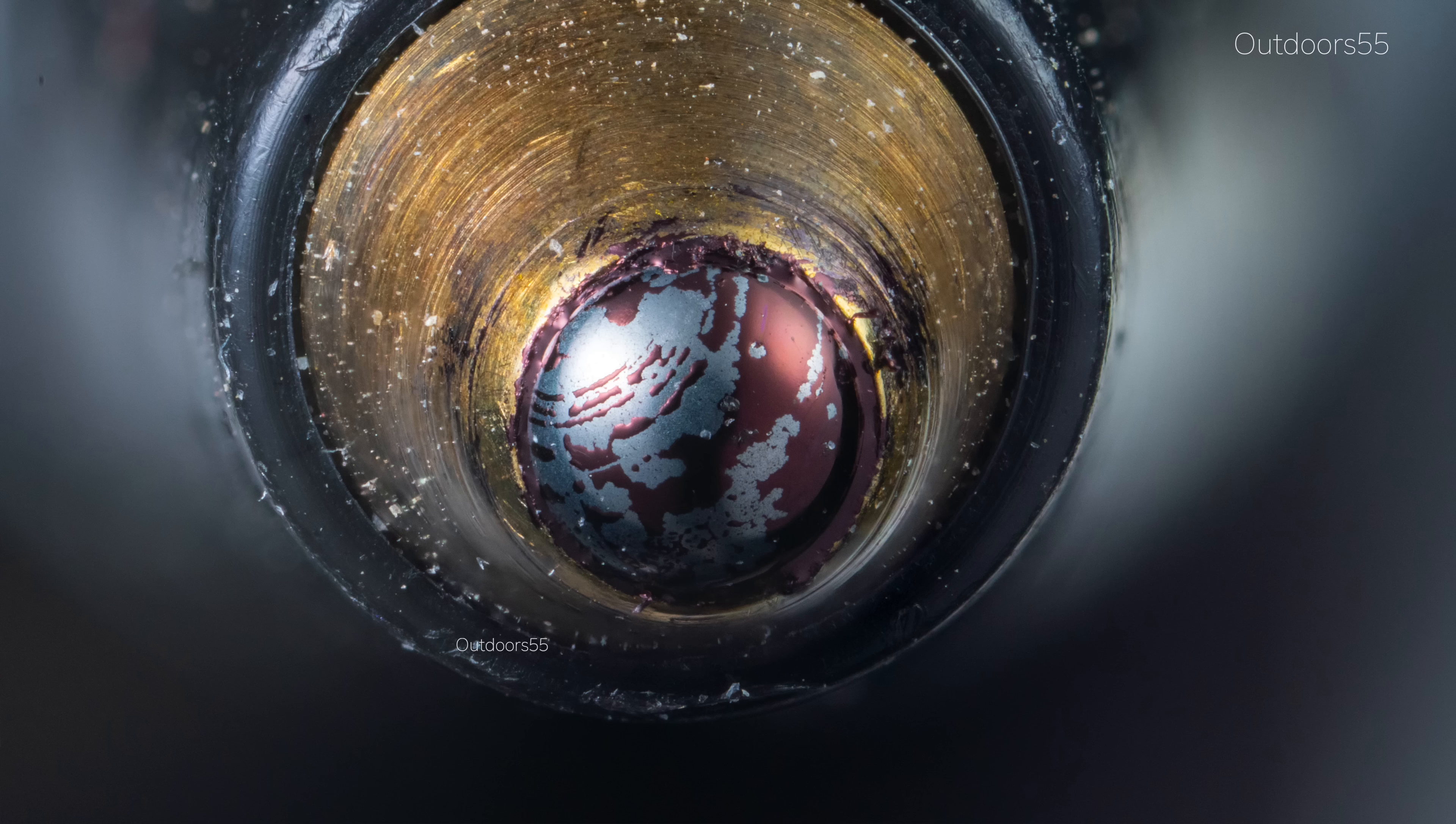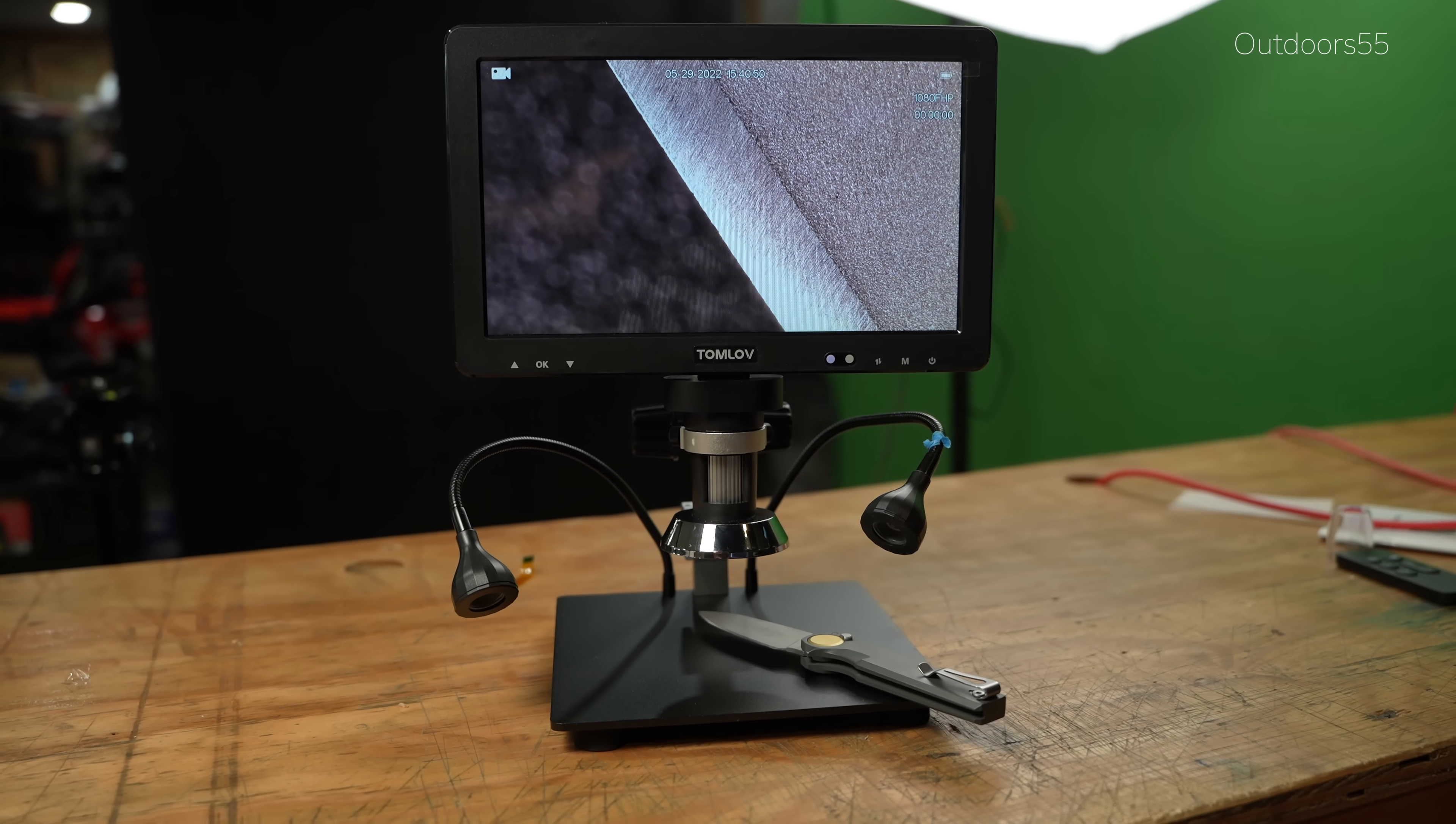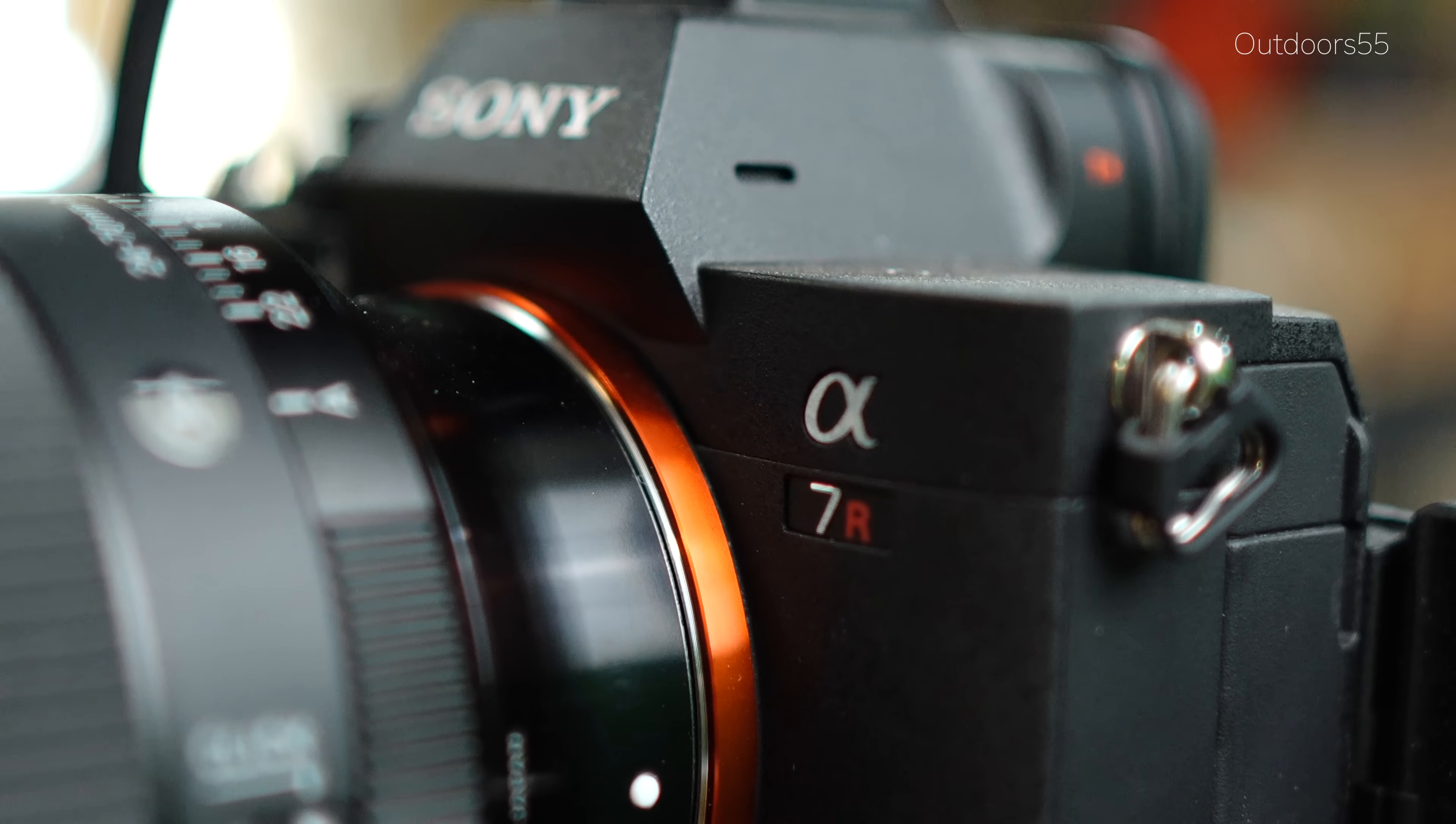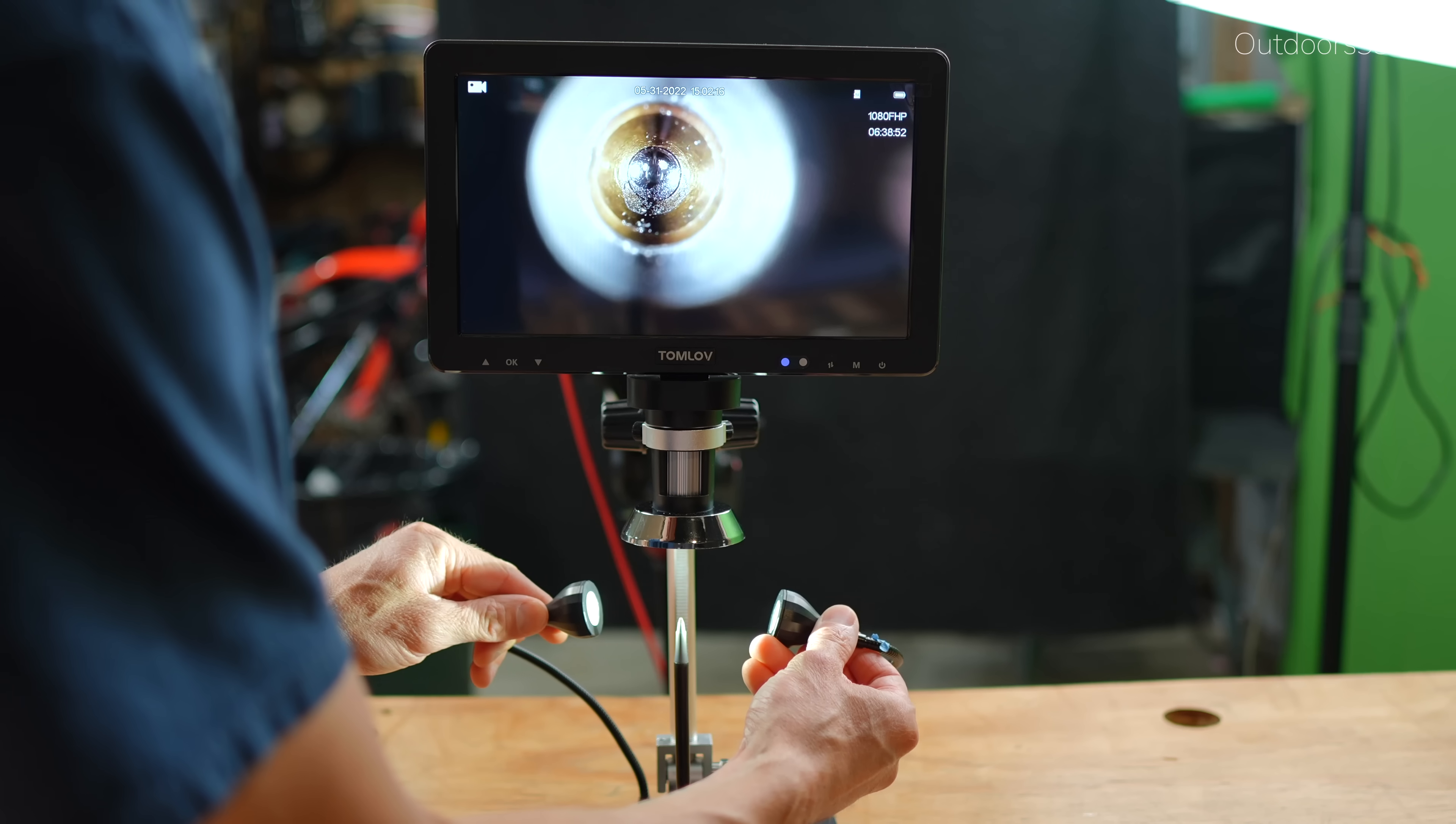But rather than just sit here and tell you you can't, let me show you why you can't get images like these out of a cheap digital microscope like this. So let's do a comparison with a 1500X cheap digital microscope to a professional macro photography and microscope photography setup and briefly run you through why these microscopes may not be what you think they be.